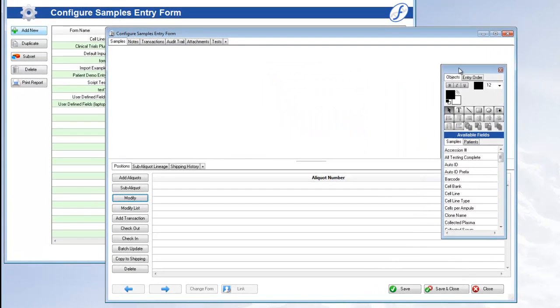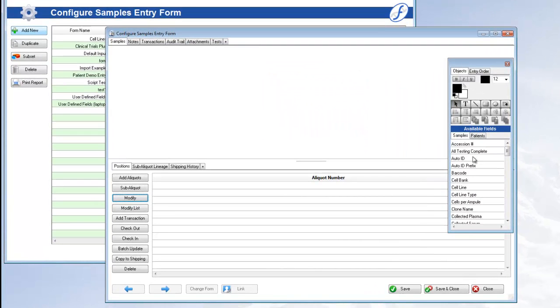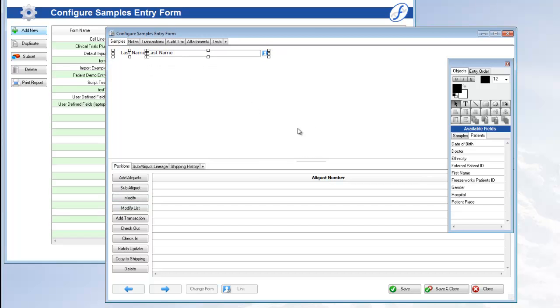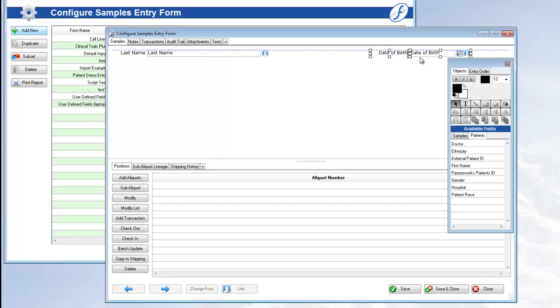Your patients fields are located on the pallet under the Patients tab. Drag over the ones you need. These are the fields you will use to link, so be sure to choose fields that help identify the patient the most.